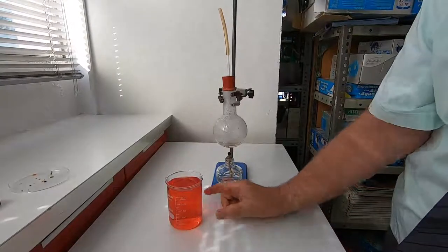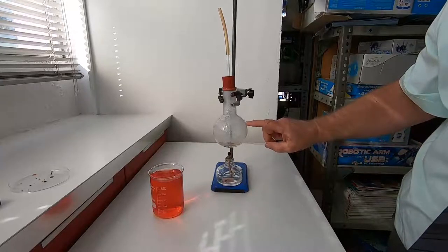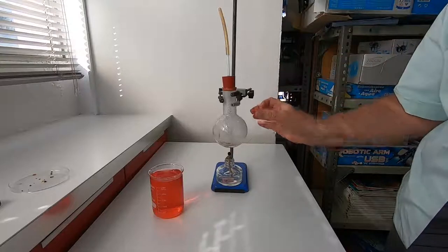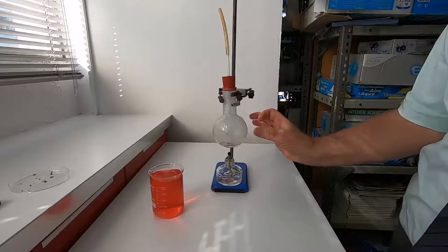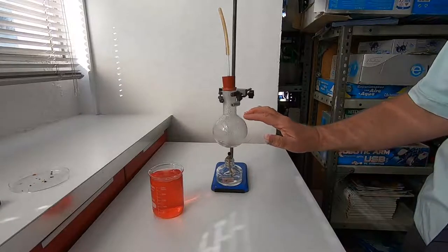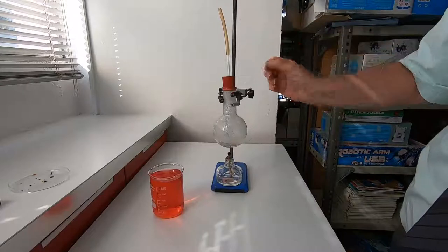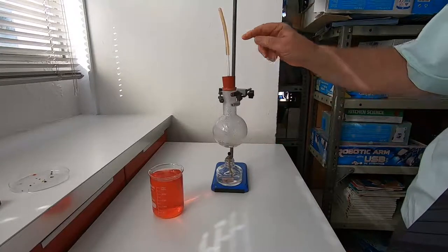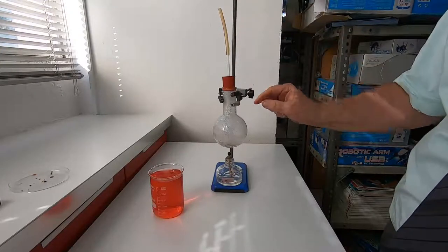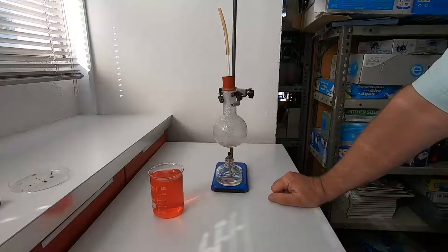The water is beginning to boil and it's producing steam. The steam is rising up and escaping, but as it goes up it takes the air with it. So the steam — water vapor — forms in there and the air gets pushed out. As more and more steam is produced, the air is pushed out of the tube, and we get it full of water vapor.